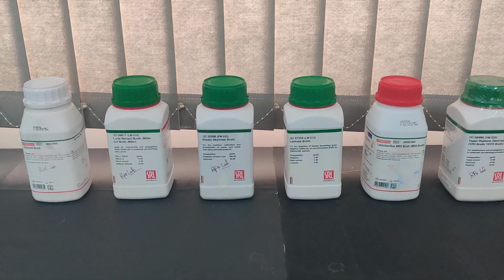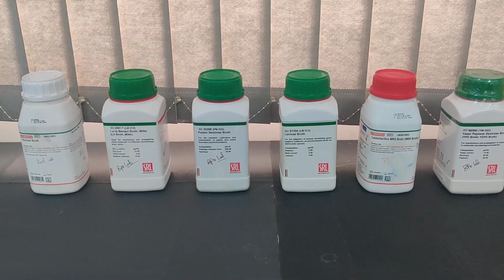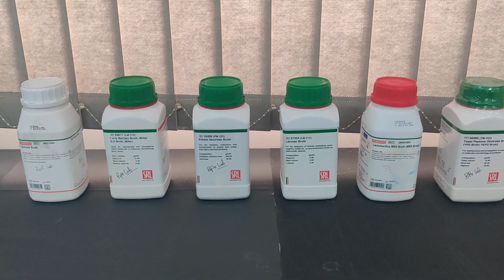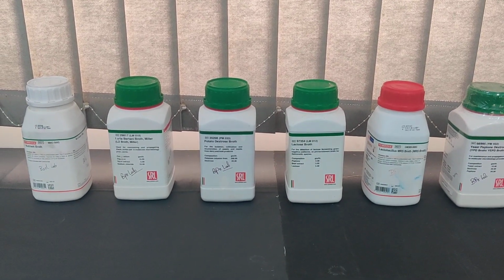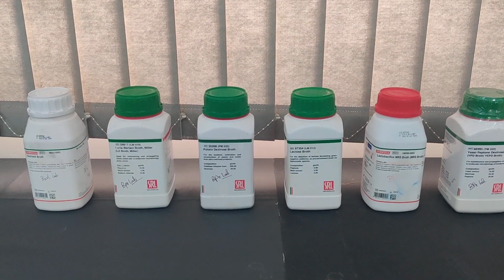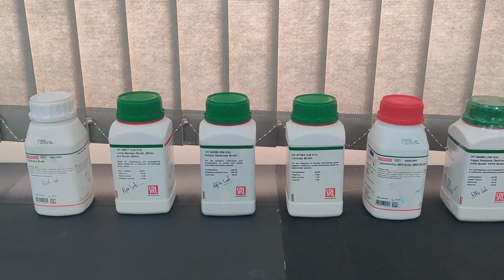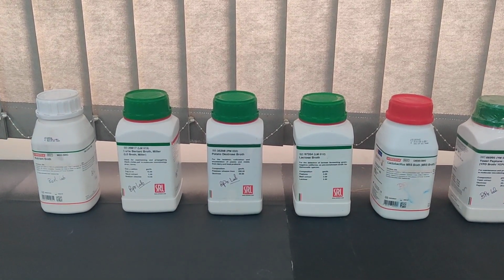So, in this session of Fundamentals of Practical Microbiology, we will be dealing with the preparation of liquid bacterial medium, or liquid microbial growth medium. For that, first of all, we will be discussing the different broths available for culturing different classes of bacteria. These broths can be classified, as we saw in the first class, as differential media, selective media, and general purpose media.